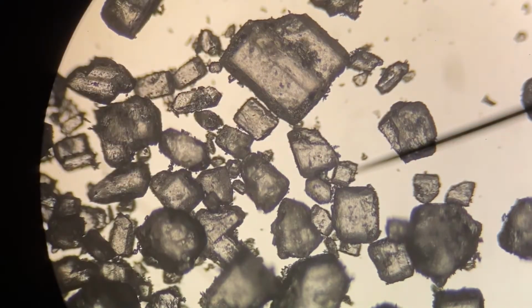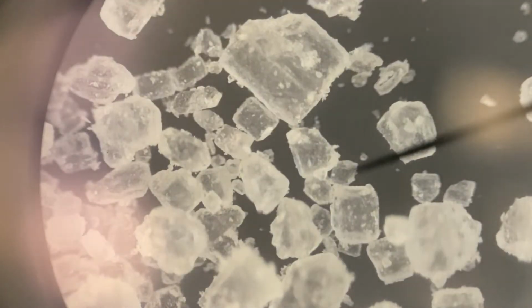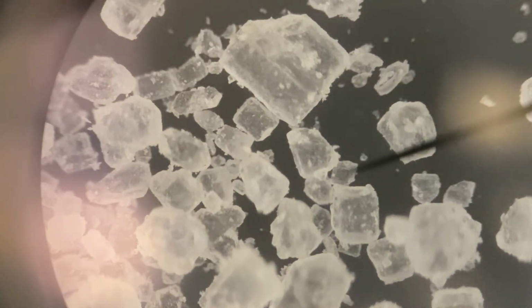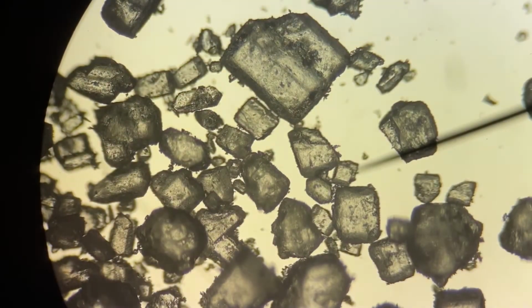Okay, there's a light on the microscope. I turn it on or off. Okay, there it is, real color. You see the whiteness a little bit more because it's reflecting a lot of the room light, so it appears white to us. But when I put a light behind it, we can see that light can actually also shine through. So now there's backlighting involved.